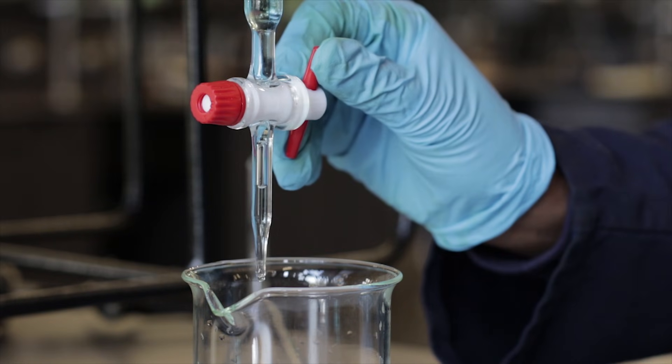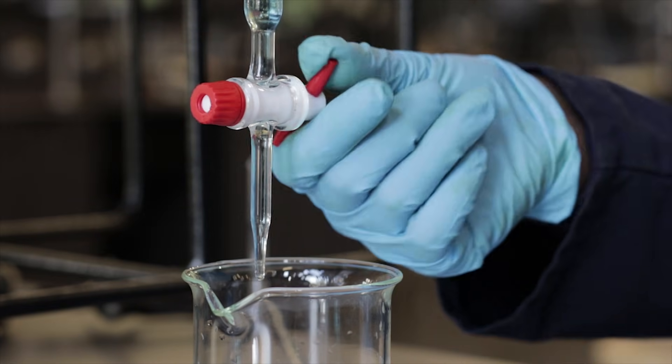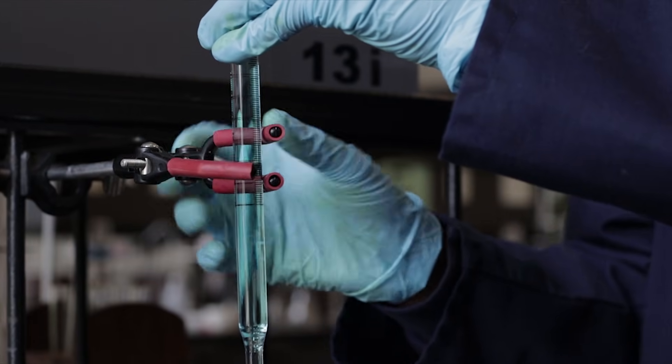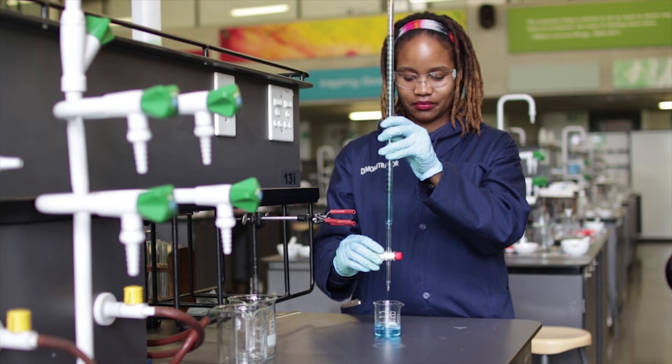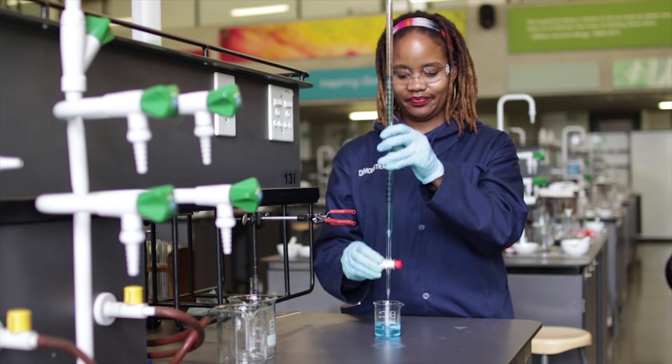The second method is to tap on the side of the burette tip while the solution is flowing. The third and final method is by taking the burette off the stand and shaking it up and down slightly while the solution is flowing making sure no solution is spilled.